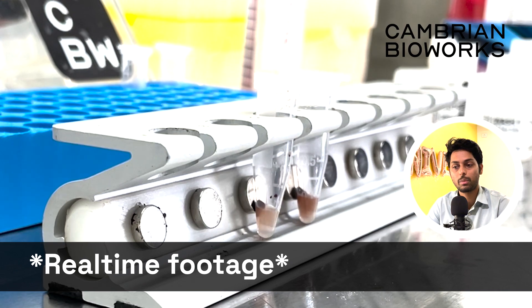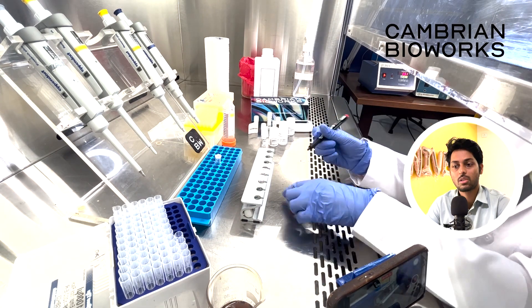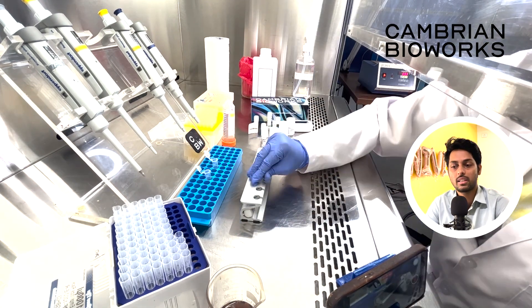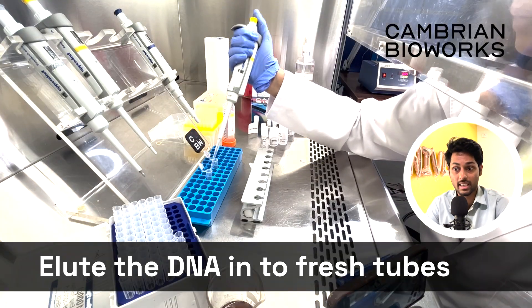What you see now is real-time footage of beads separating from the mix and all the DNA being released into the elution buffer. This is when you can label your new tubes. Now you're ready to transfer your freshly isolated DNA onto your new microcentrifuge tubes — it's ready for your downstream applications. That's as simple as it can get.